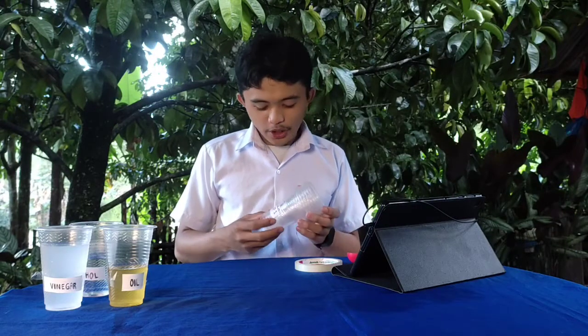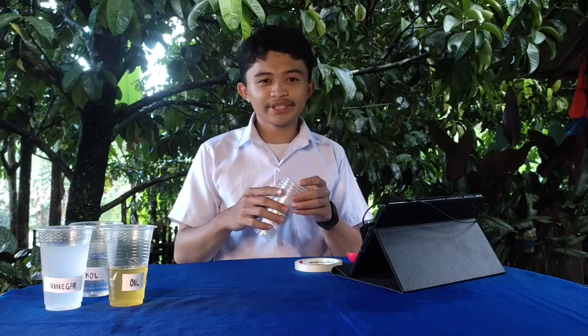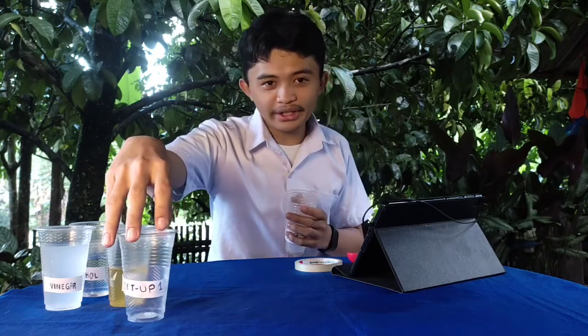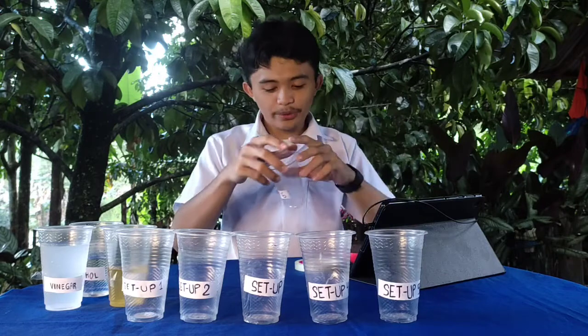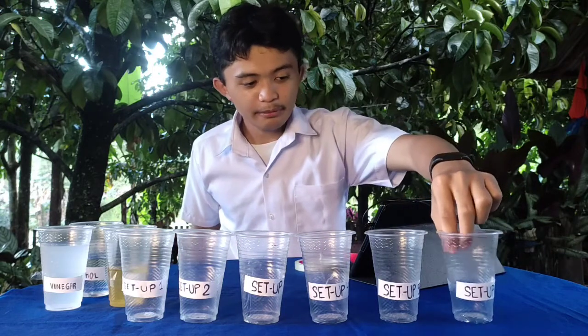Let's proceed to our procedure. Let's arrange our disposable glasses according to the setup level. We have setup 1 and lastly we have setup number 6.